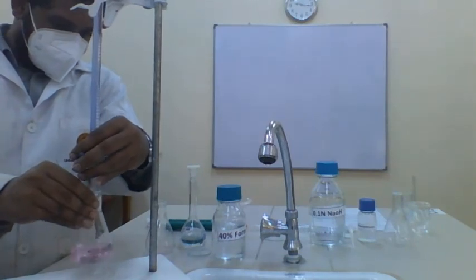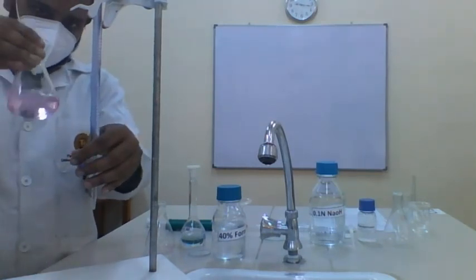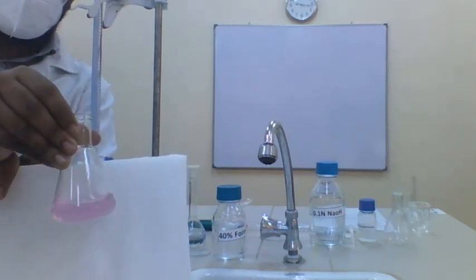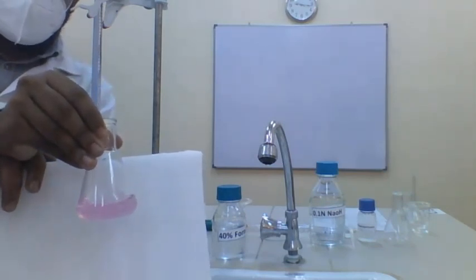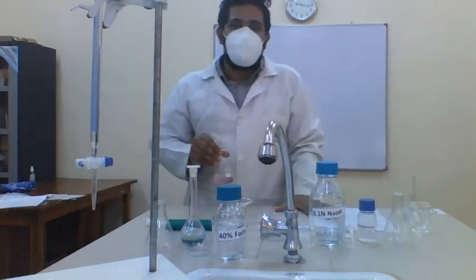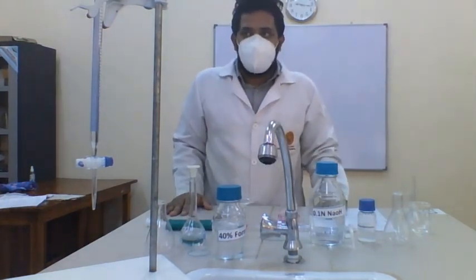So now my endpoint is very close. And you can see our persistent pink color. At the end point, the pink color would not disappear. You have to get the constant pink color at the end point. So this is the Sorensen's formol titration. When we are doing this experiment, usually we have to at least triplicate the procedure.